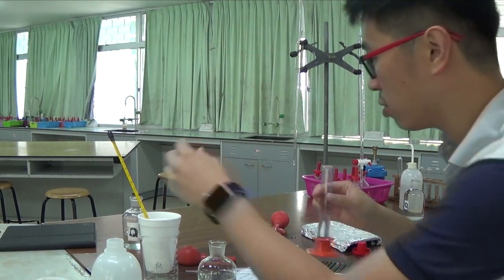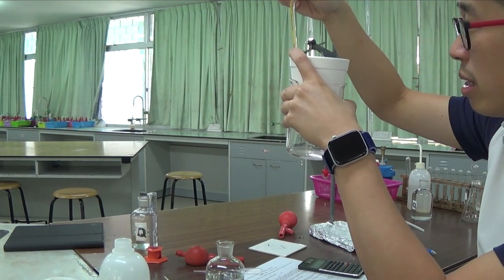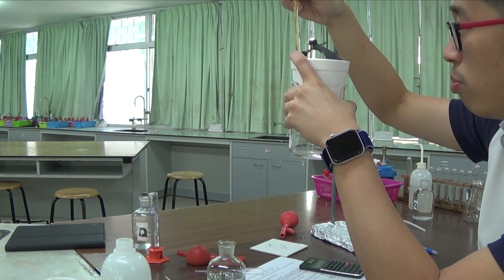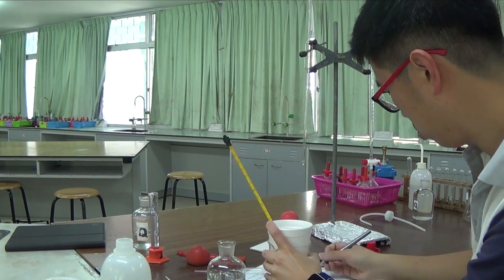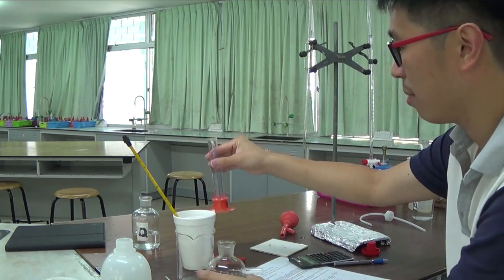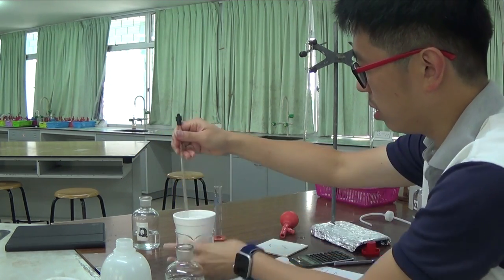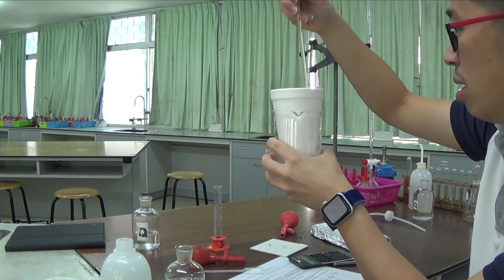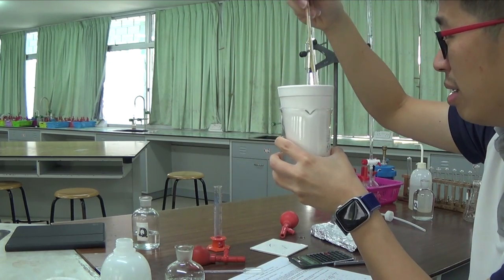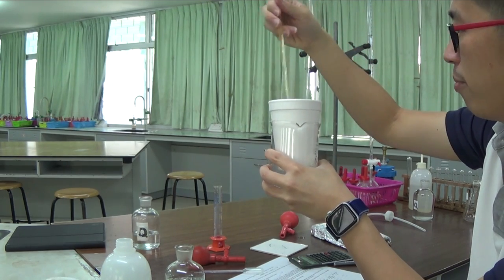So this is experiment 3. I haven't recorded my initial temperature. I've already let it settle there for a bit. It's 22.0 degrees Celsius. Now I'm going to add this in and I will read the temperature. So the temperature is increasing rapidly. I'm stirring very gently with my thermometer.